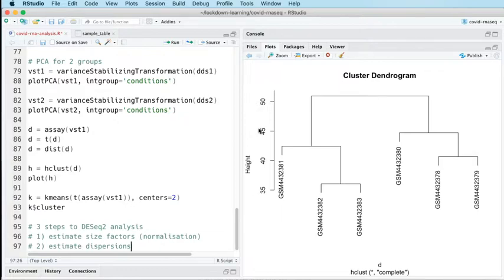it's a measure of the variance, and it's the sum of the biological variance, so that's the naturally occurring stochastic variance in gene expression, which we can estimate from our count data, but also what's called the shot noise. So the shot noise is the systematic experimental variation, essentially a measure of the uncertainty of read counting as a quantitative metric.